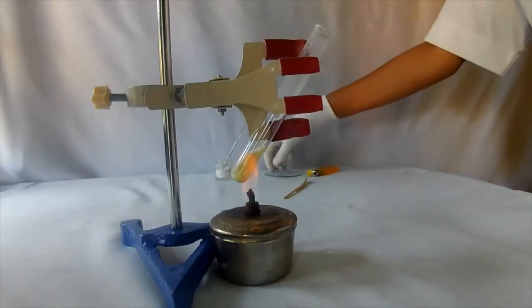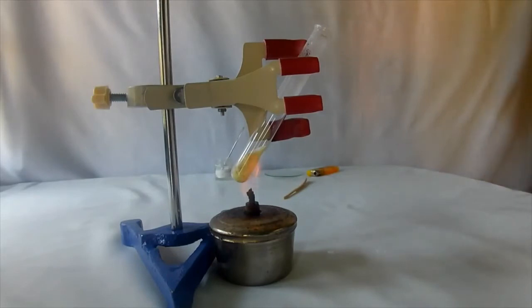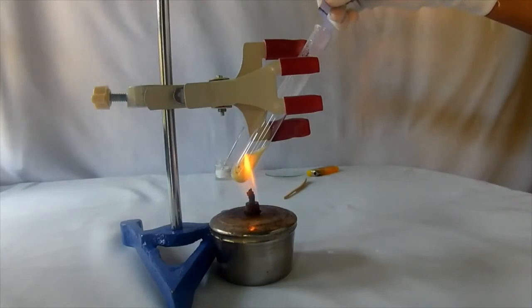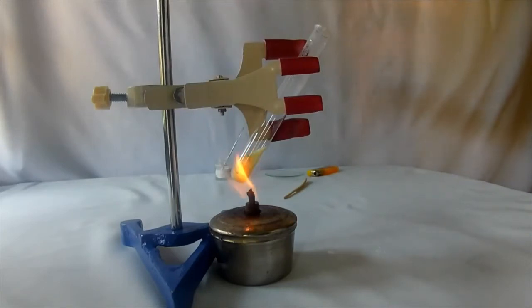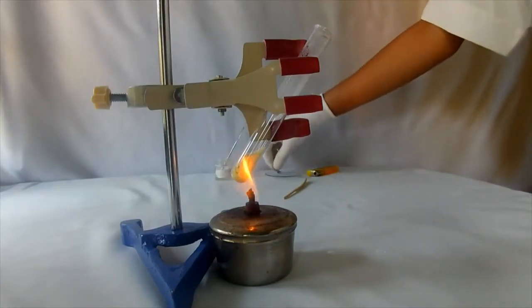See, now the color of the salt has changed. Introduce a blue litmus paper into the test tube.